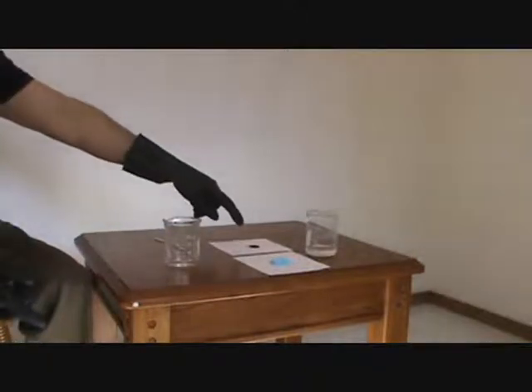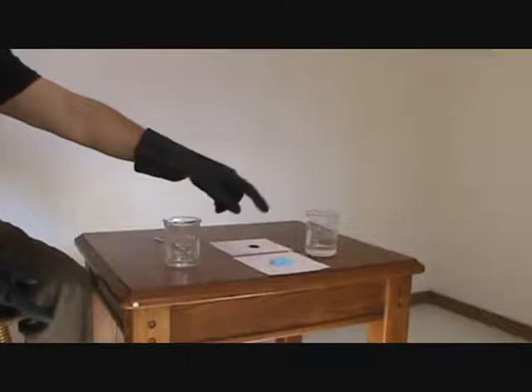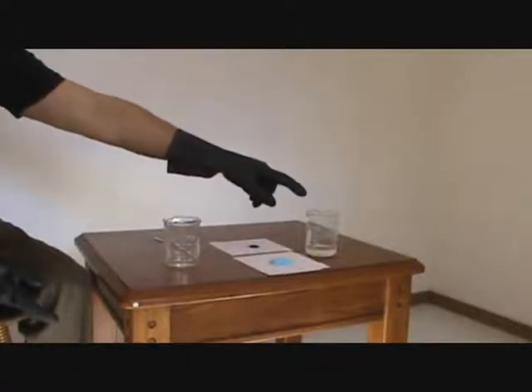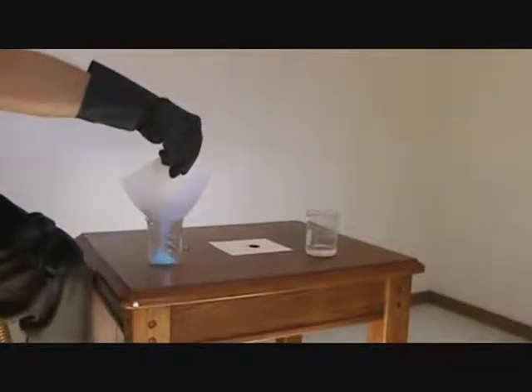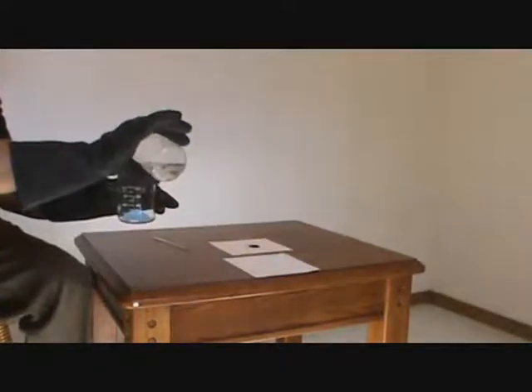Now step 1 is to react iron and copper(II) sulfate. Here I have 1.5 grams of iron filings, 8.0 grams of copper(II) sulfate pentahydrate, and 50 milliliters of distilled water. I will now place the 8 grams of copper(II) sulfate pentahydrate in the beaker, and the 50 milliliters of distilled water in the beaker as well.